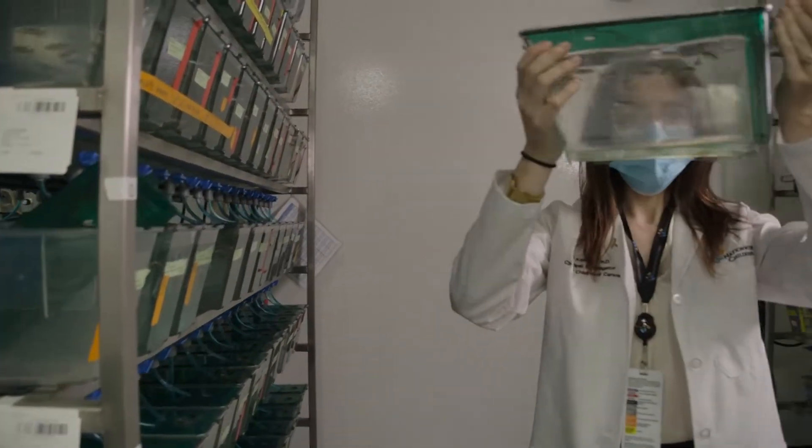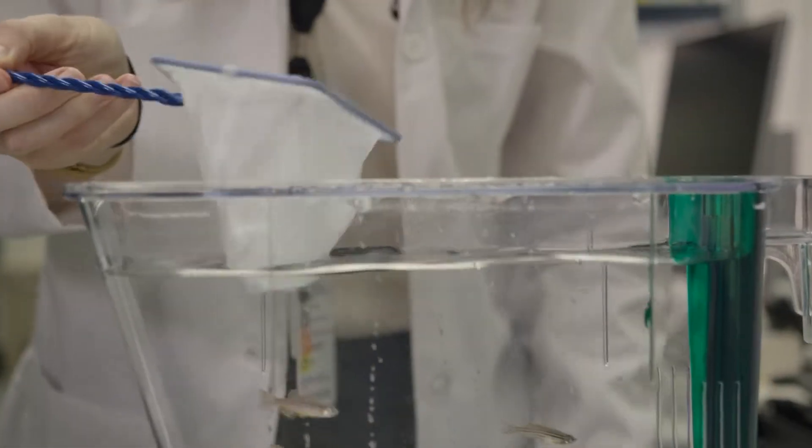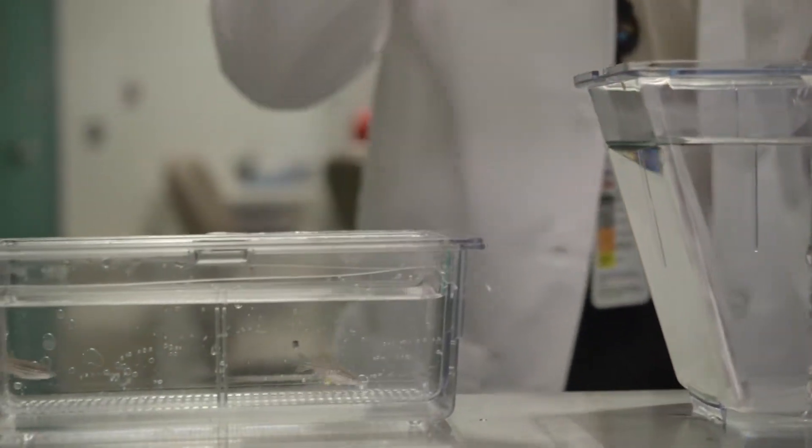Zebrafish have significantly contributed to our understanding of cancer, and a fish could be a stand-in for a patient who you don't want to put through all of those different treatment options.